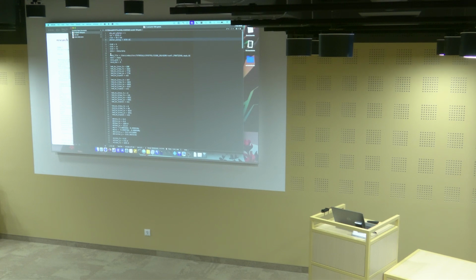Then we have some information about the mask file. If you want to mask out specific pixels, you have to specify here how to read it. And then we basically have different descriptors of each of the panels. So basically, where is each panel located? Where does it start? Where does it end? And if there is a specific offset to it.